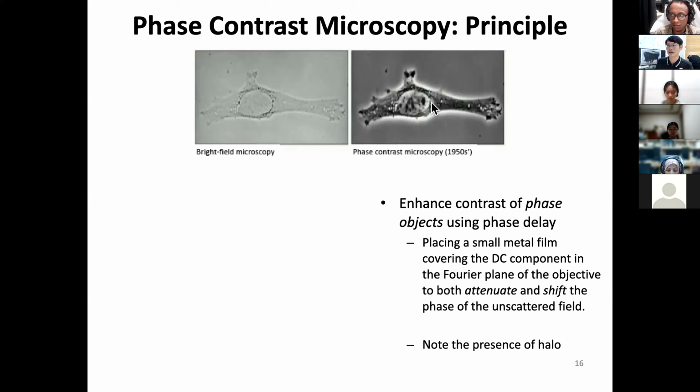I think you can also consider from this mathematical description, as bright field intensity is 1 plus j phi magnitude square, and that's a real number, and that's close to 1. That's why it's almost kind of uniform light, while this one is 1 plus, and this phase becomes converted into an intensity.